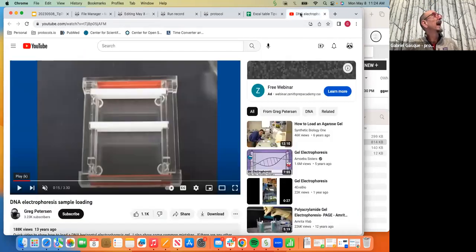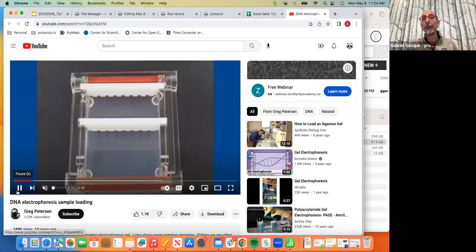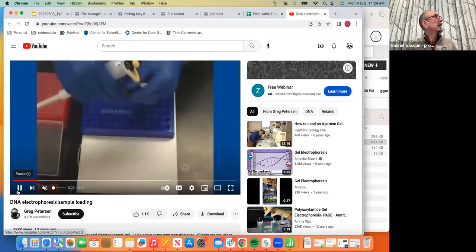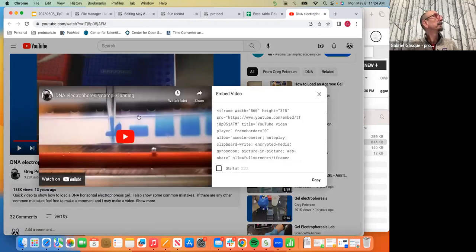So I have my video here on YouTube. You can see it. It shows you how to create and load a gel. And to insert this video into my protocol, I have to go to share, select the code for embedding, copy it.